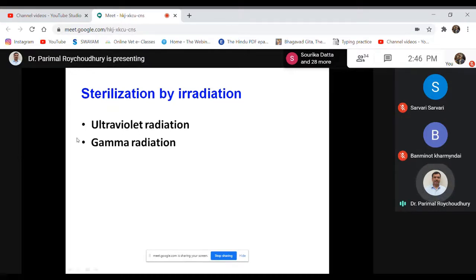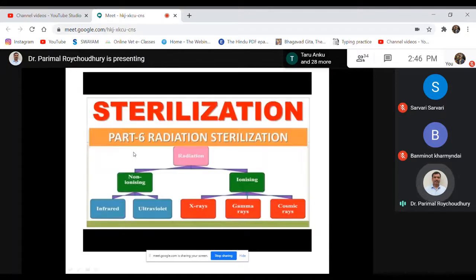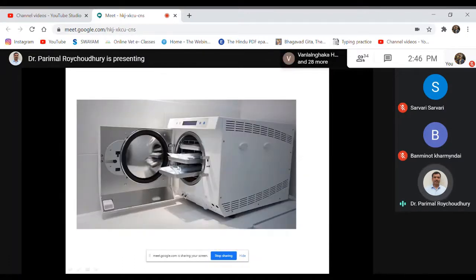But the gamma radiations are much more powerful than the ultraviolet radiation. This gamma radiation comes in the form of a device, what we call the gamma chamber, where we can put the surgical items and the plastic syringes. Nowadays, the disposable syringes that we use on a regular basis for injection purposes are all sterilized by gamma ray sterilization. So gamma rays are much more powerful and can kill all types of organisms, including the resistant spore.